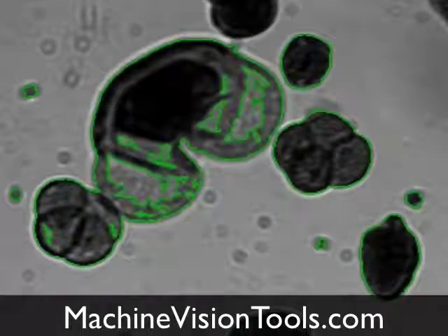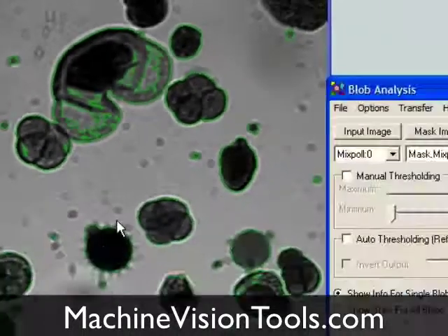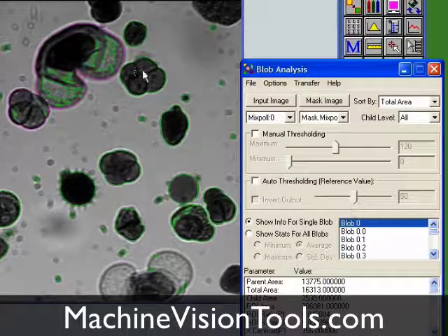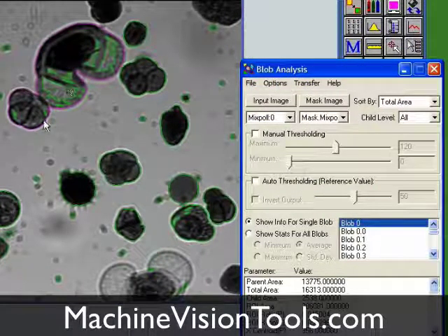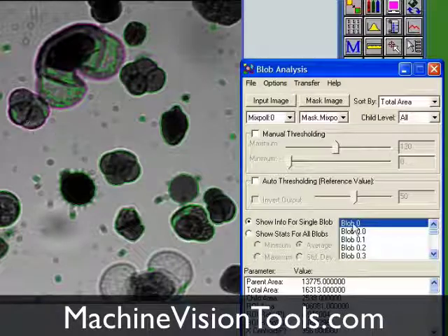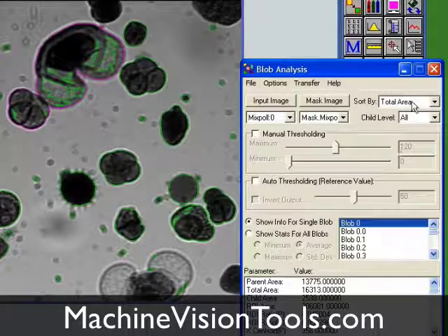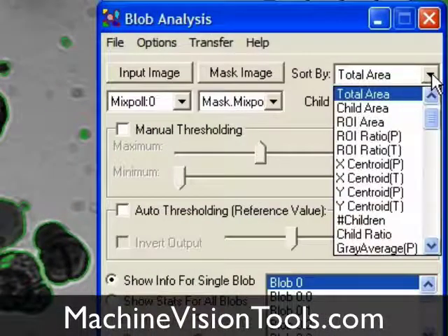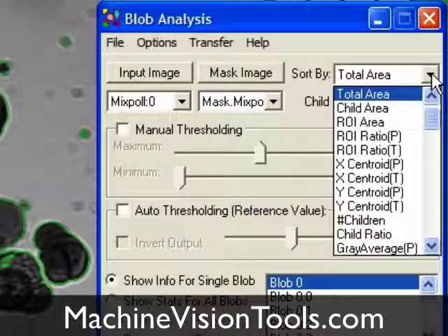Each blob is a freehand ROI that we can use just like any other ROI in HLImage++. We'll click on a blob in the list, and as you can see, it's highlighted in the image. This particular blob is blob number 0, the top one in the list, because we've sorted the blobs by total area, and that's the largest blob.